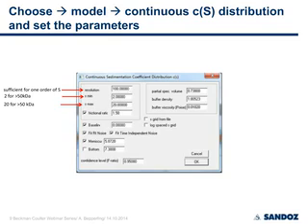If you have smaller proteins, you may set it from 0.5 to 10. For example, if you have cytokines or proteins like that in the range of 10, 20, 30 kilodaltons, we have some of them on the market, so there's also need for that. The 1.5 frictional ratio is a good starting guess for a monoclonal antibody. You want to check this and let it fit. You also want to fit the baseline and the time and radial invariant noise, so you always check on both noise contributions and also the baseline.